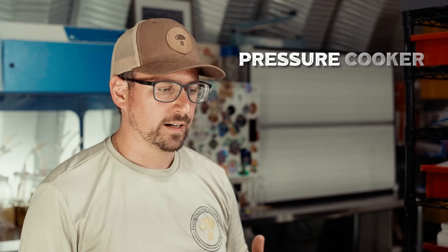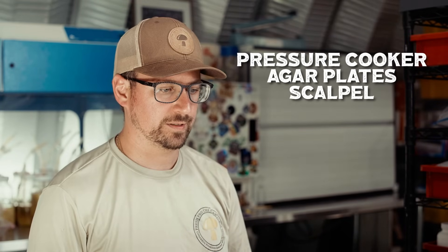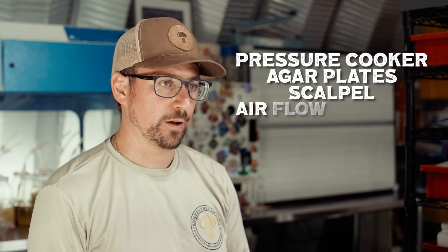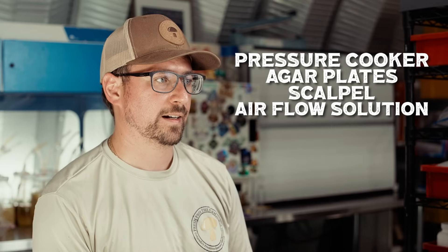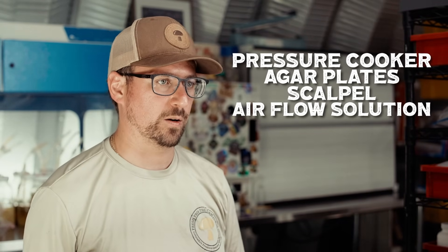Some essential equipment includes a pressure cooker, agar plates, scalpel or inoculation loops, and an airflow solution — either a flow hood, an FFU, or if necessary a still air box. Affordable alternatives include mason jars for pressure cooking and glove boxes, though glove boxes are not recommended because they can get very cumbersome.